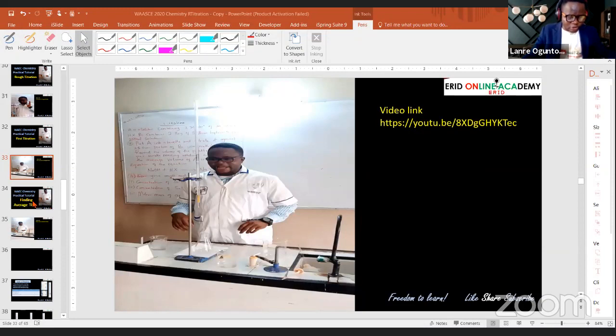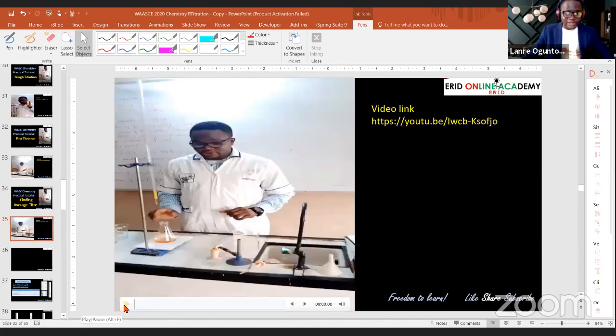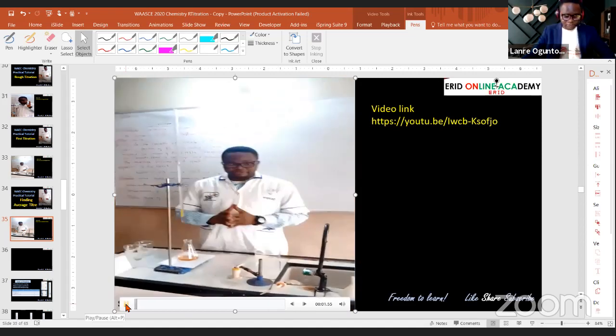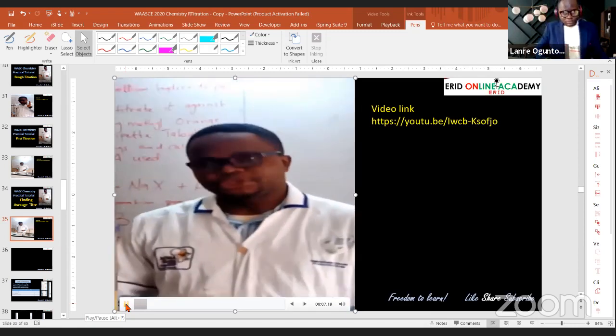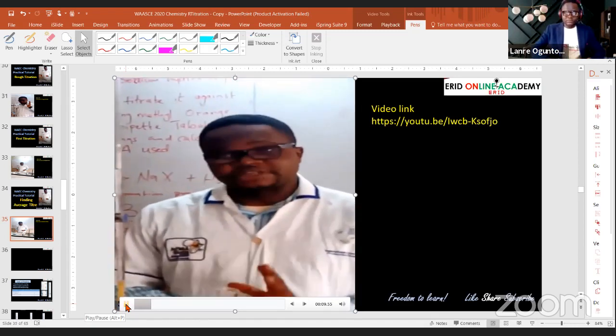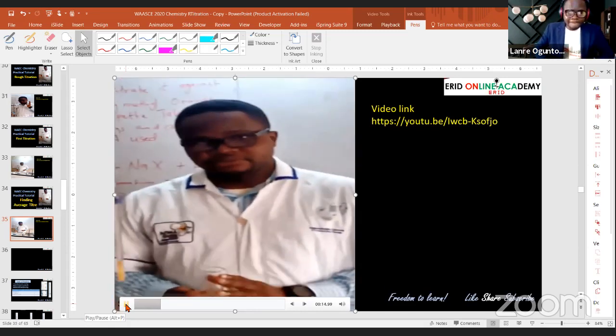Now let's move on to how to find your average titer value. Then we'll do calculation. So how do you find your average titer value? You have done your first, your second, and your third titration. Now you want to get your titer value, the volume of acid used, that you can use for your calculation. You will repeat the same procedure as you did for your first titer value to get your second and third titer values.